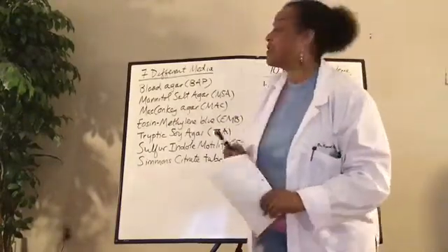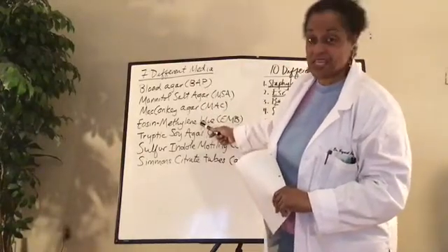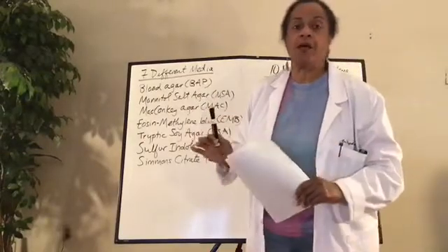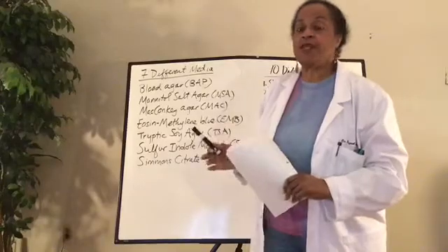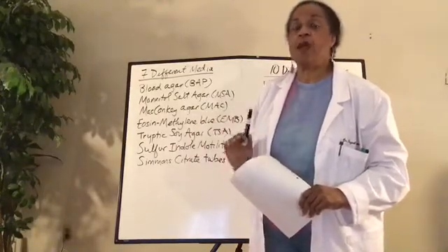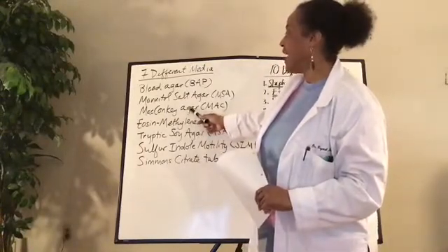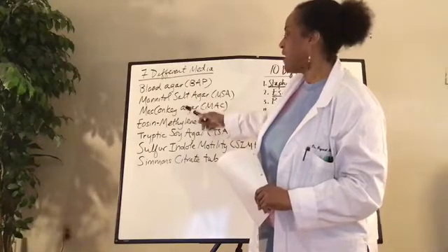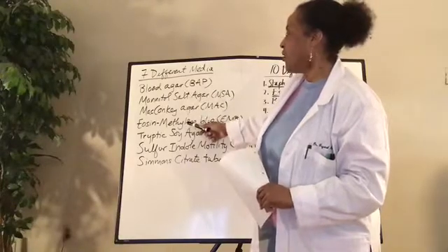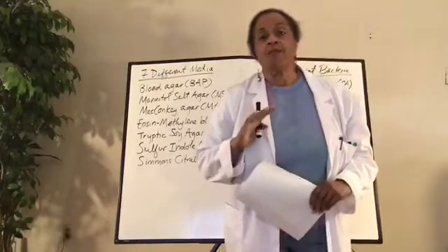One important thing to know is that these are really all kind of reddish color. That's why I remember telling you before, don't just go over there and grab the plates, because when you get back to your desk, you won't know what you have. They're all red, different variations of red. The MacConkey is a lighter red, kind of pinkish, but it can still make you think it's maybe mannitol salt, or this one's kind of darker. Anyway, they're all variations of red, so you don't want to get them mixed up.